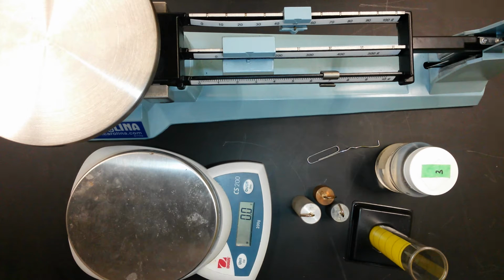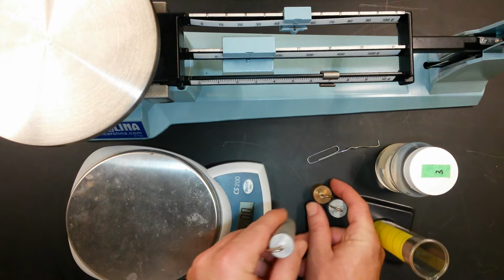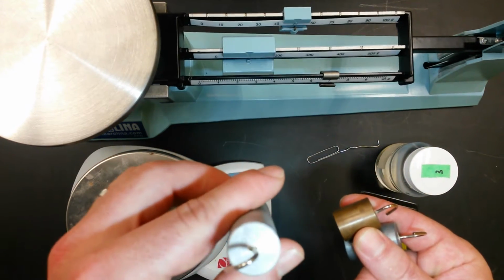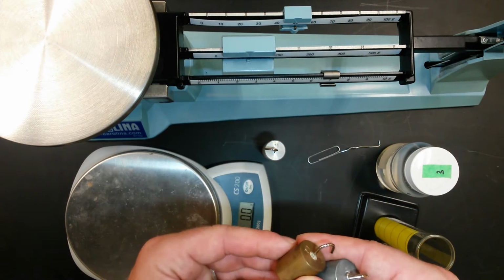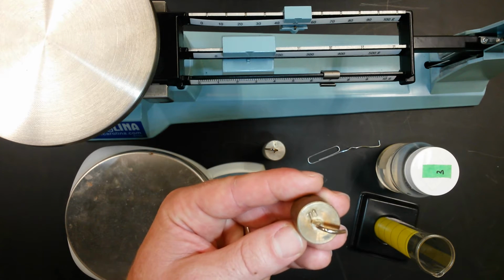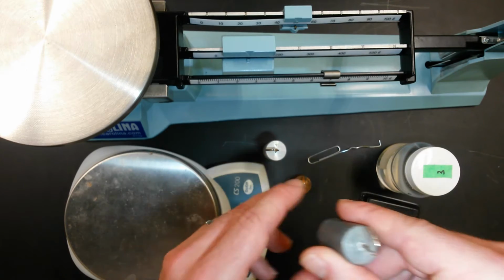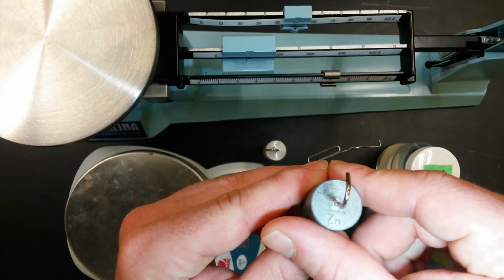And the goal of this lab is to see how those two kinds of measurements are different from each other. What we're going to do is we're going to have three different objects, and those three objects are going to be these metal blocks. This one is made of aluminum. This one is made out of copper. You can see a little Cu on there. That's the symbol for copper. And the last one is made out of zinc, and you can see a little Zn, that's for zinc.